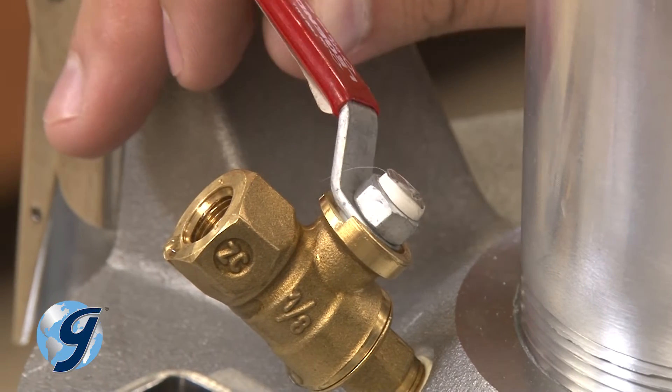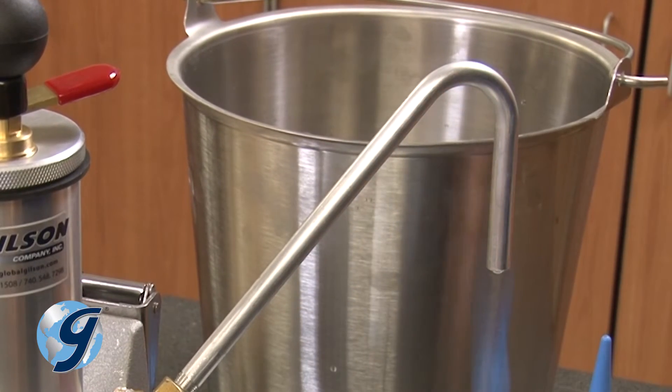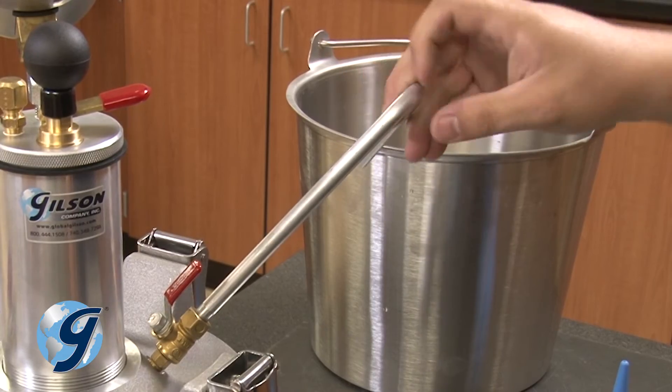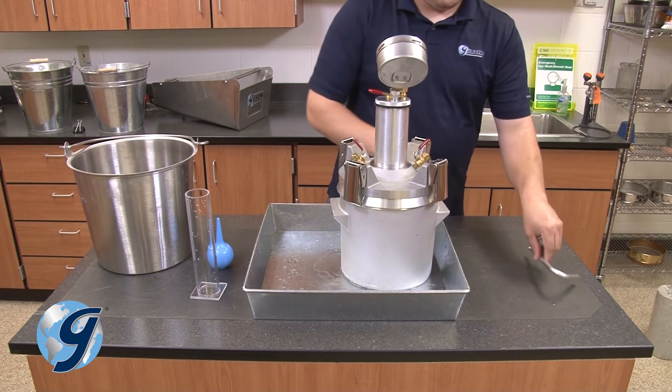Now, open the opposing petcock to allow water from the bent calibration tube back into the base. Once the water flows back into the base, we can open the other petcock and remove the bent calibration tube and set it aside.